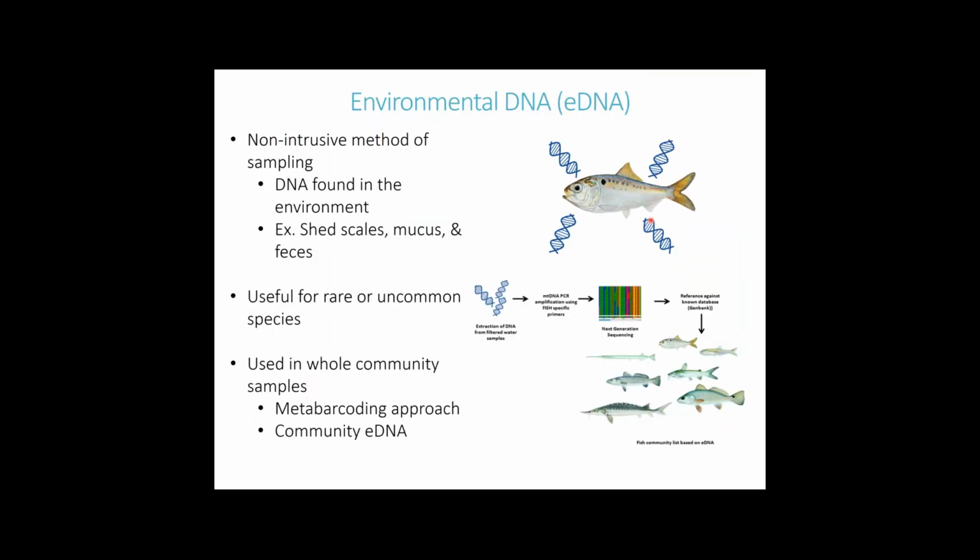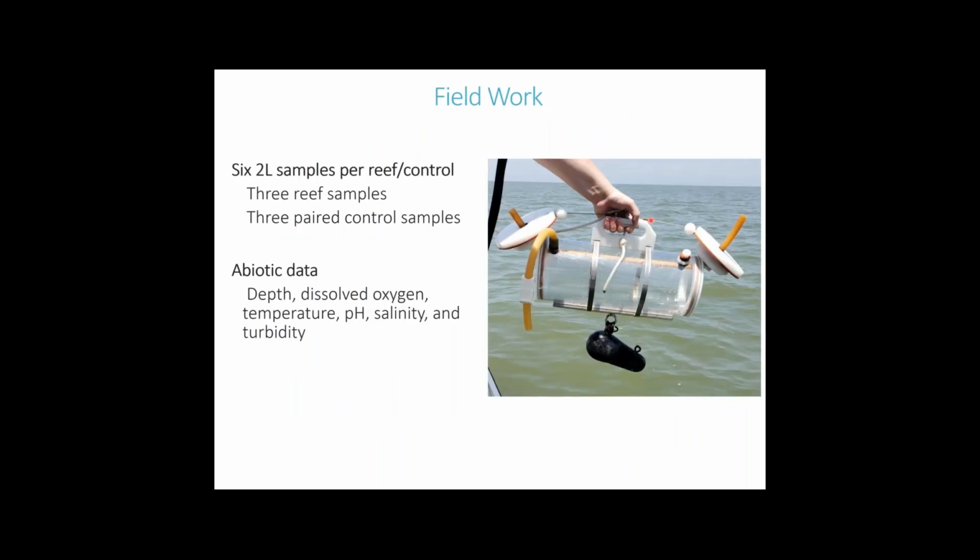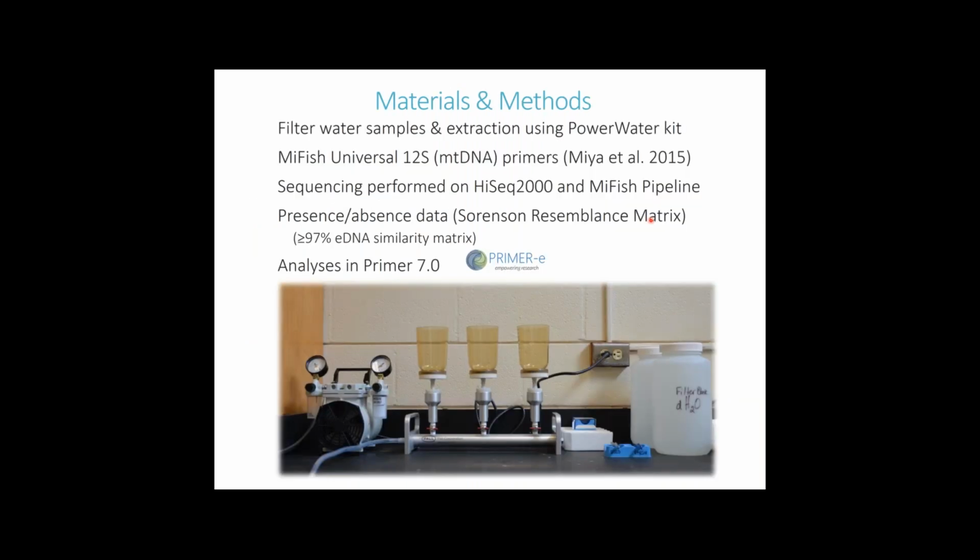We used the same approach as in the previous study: metabarcoding DNA. Van Dorn sampler, 3 water samples from each reef, 3 water samples from each control, abiotic data using the Van Dorn sampler, and the same type of analyses as in the previous study.